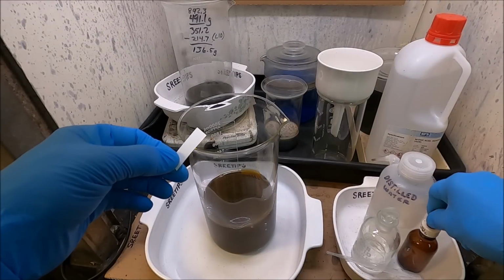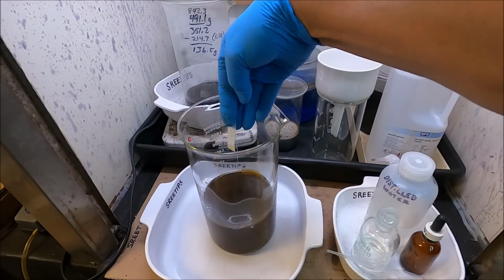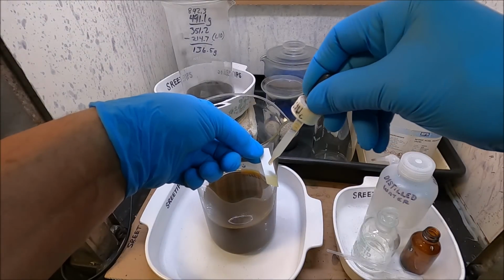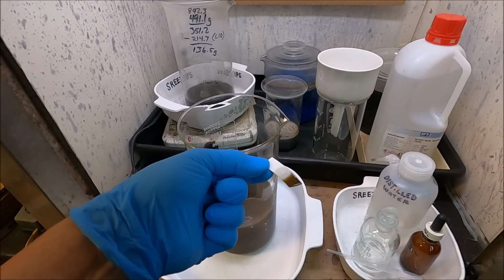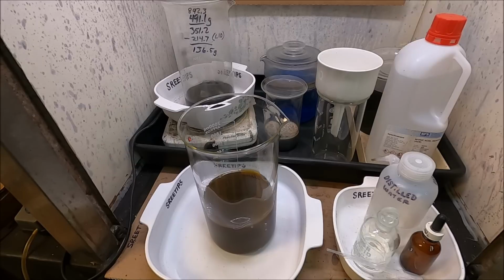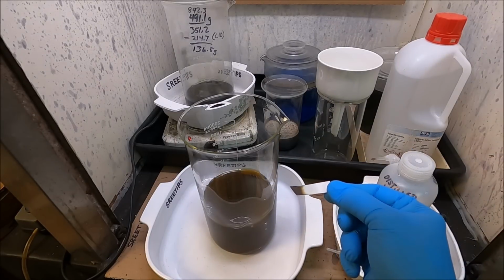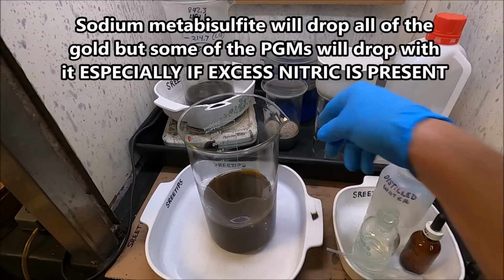Got me a piece of filter paper. Get a little bit of our solution on there. Let's just do another stannous test just for good measure. And definitely got precious metals in solution. You see a tint of orange along the top and it's brown down below, so I think we're going to have platinum group metals and gold in solution here. Okay, I think I see just a touch of green on that as well, which means we've got a little bit of palladium in here also.